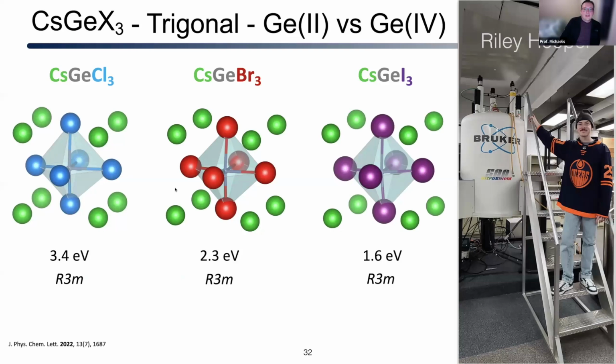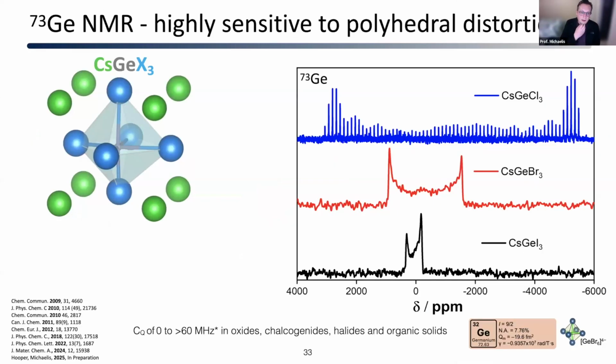Before we went into this, I wasn't even sure if they would be stable long enough to actually do any NMR experiments on them. And so Riley, who was basically our germanium chemist in the group, who's at TUM now, looked at these systems. I asked him to first try to synthesize just the parent phases to make sure that we can maintain them long enough to do characterization on them. And he was able to do this, and he has some really nice results from the 900 facility in Ottawa.